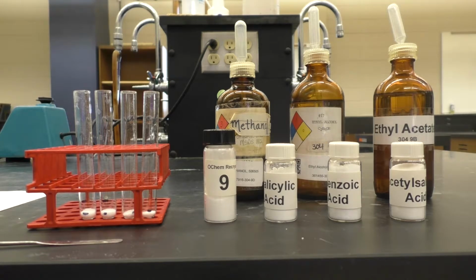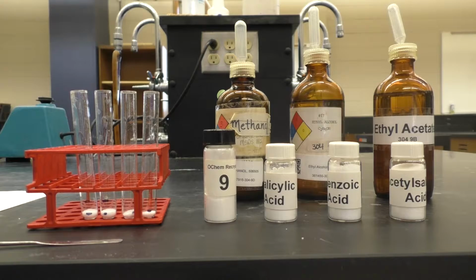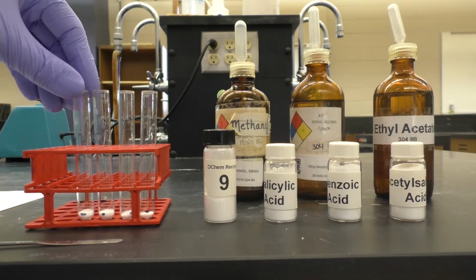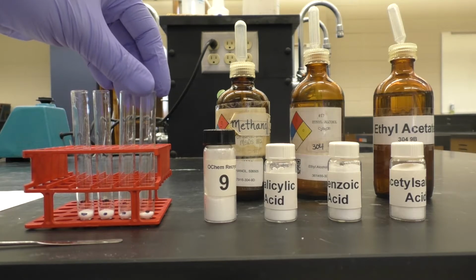Now I'll add approximately the same amount of solvent to each of them and vortex them in order to mix them well and see what the solubility characteristics are like. I'll do them in the order that I have shown. I'll use water as the very first one, then methanol, ethanol, and ethyl acetate.